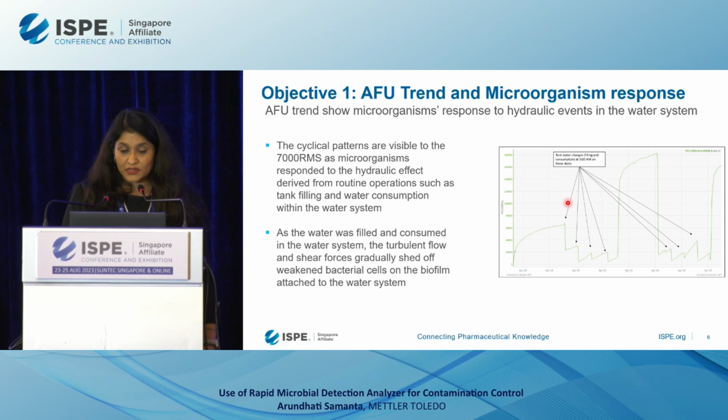How do we know that they were sanitization? Only because we also look at the temperature. The first one I want to talk about is routine operation. The beauty of the analyzer is you have all of this data time-stamped by the second. The data comes in every 2.2 seconds, so you know exactly when you have the spike.